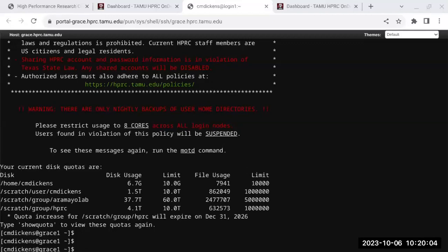This mate pair, if you map it back to the genome, is going to be whatever you selected your insert size for, which in this example is 2,000 bases. So the fragment size here is 400 bases, but your insert size is 2,000 bases. Insert meaning if you align it back to the genome, it'll span 2,000 base pairs.